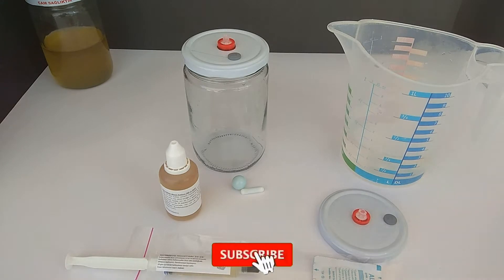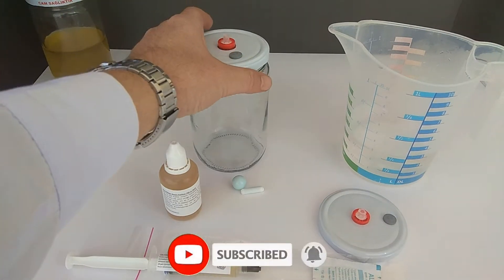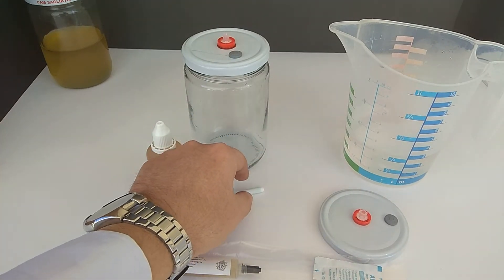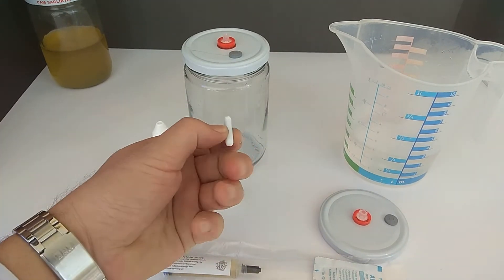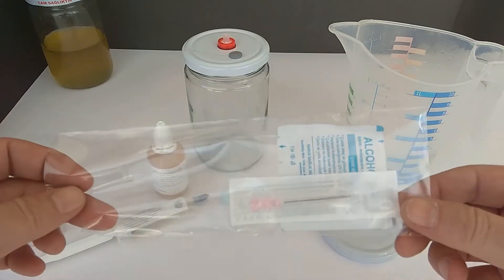For this process, we need 300ml of hot water, a jar, a lid with a filter and an injection port, a powder or liquid main culture additive, a glass ball or a magnetic stir bar, 10ml of liquid culture, alcohol cleaning wipes, and a sterile needle.